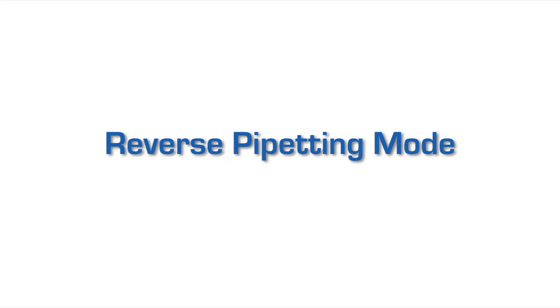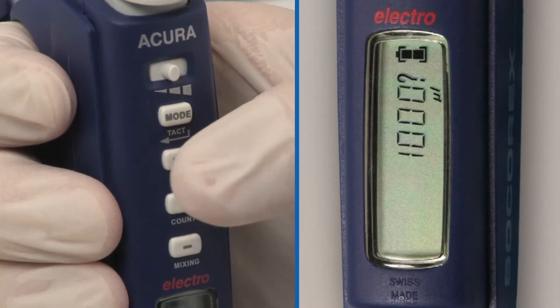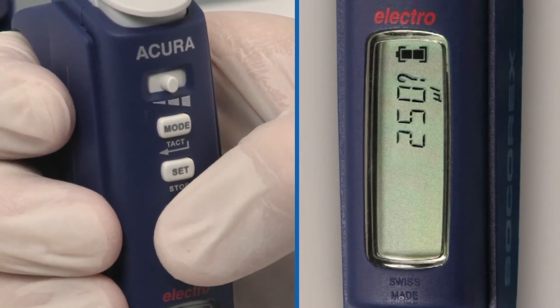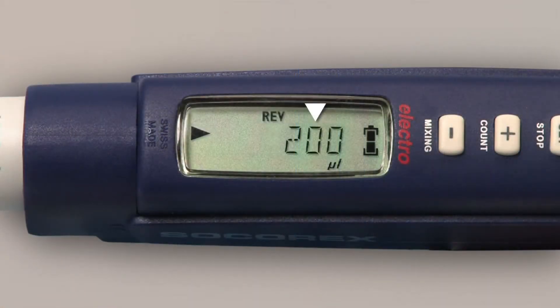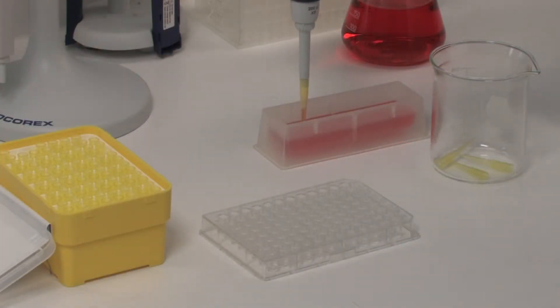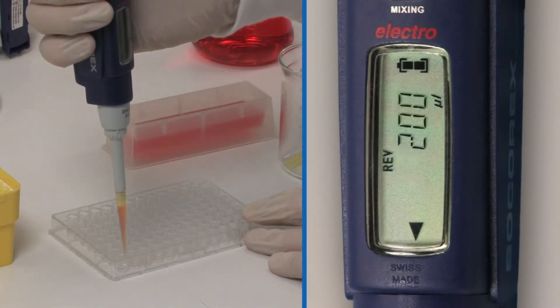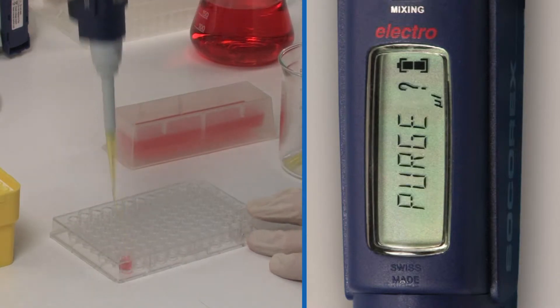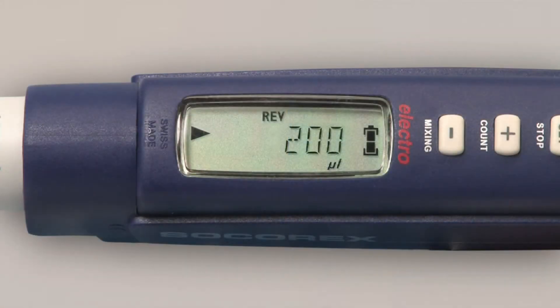Reverse mode corresponds to an aspiration in excess, followed by the dosing of a set volume. It also enhances reproducibility below 20 microliters and is especially recommended for viscous and foaming liquids. Press mode several times until the display shows reverse. Press set to validate. Press the plus/minus keys to display the desired volume and press set again to validate. The display shows the selected mode and volume; the instrument is ready to aspirate. Aspirate the liquid, and the display shows it's ready to distribute. After distribution, the display shows purge. To eliminate the excess liquid, double-click on the start button.